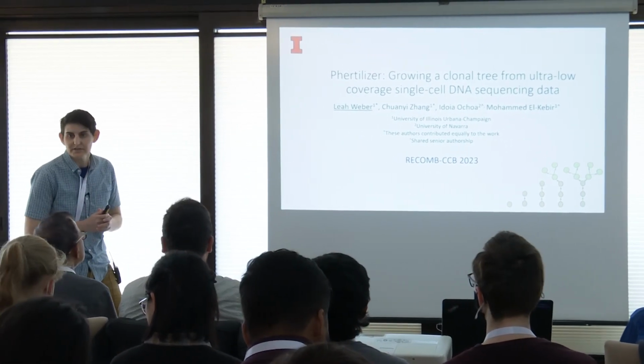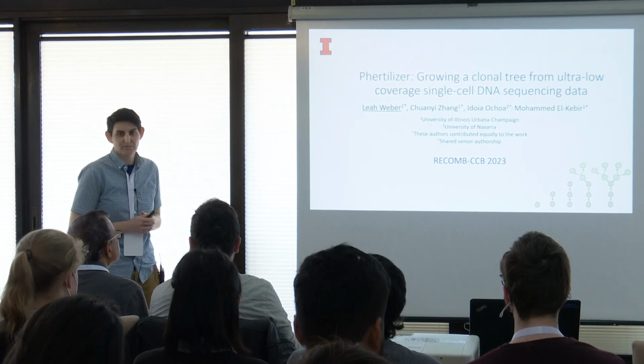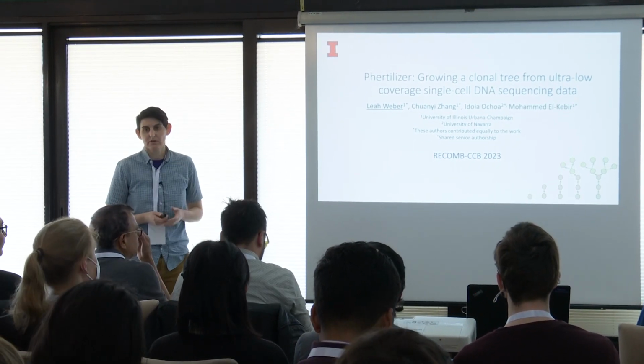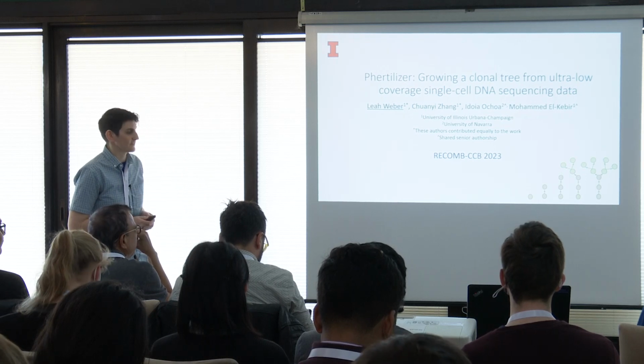Okay, so I'd like to start off by thanking the organizers for giving me a chance to present our work. Our method is called Phertilizer, and we're growing a clonal tree from ultra-low coverage single-cell DNA sequencing data.